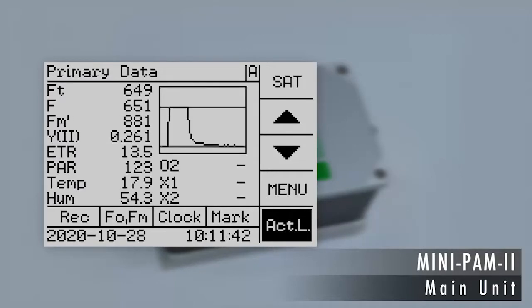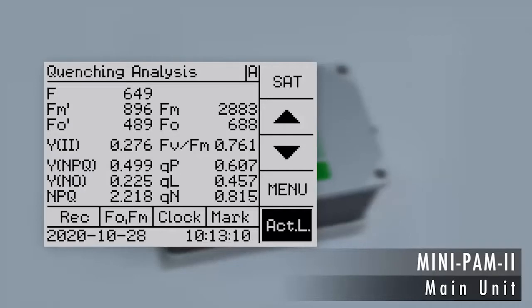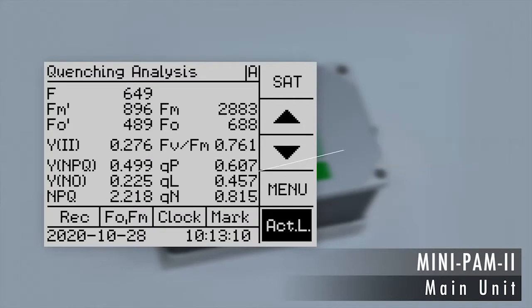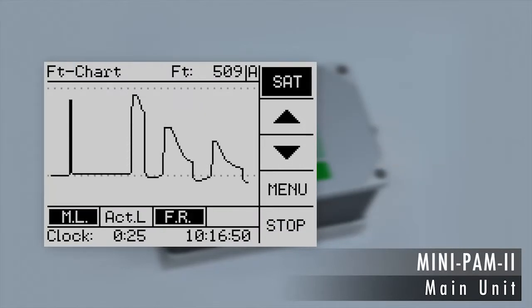More data plus the fluorescence kinetics of the last saturation pulse can be found on another screen. The parameters of photochemical and non-photochemical energy quenching are only a tap away. You can also view the time course of fluorescence.